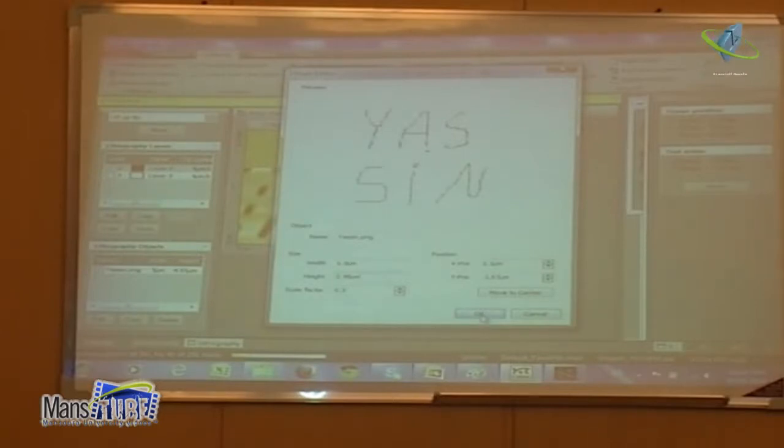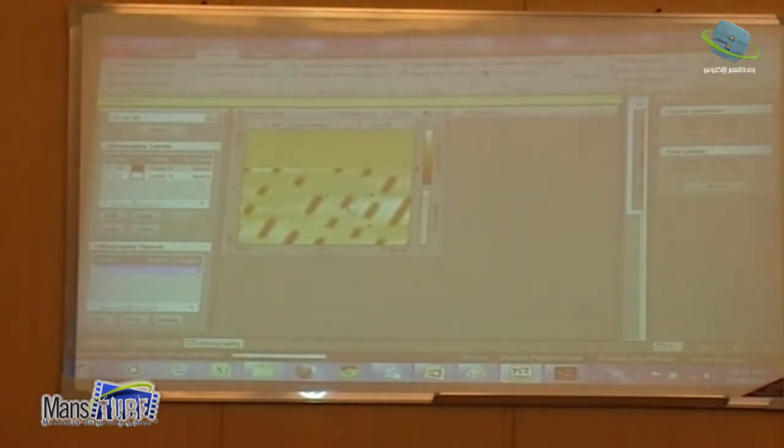Okay. And now maybe we can put it one. You already write something. One here we already write something. Okay. It's okay. Let's say put it here. Just, even if we'll not scratch everywhere, but like this. Okay. And then I will make imaging, spectroscopy, lithography.